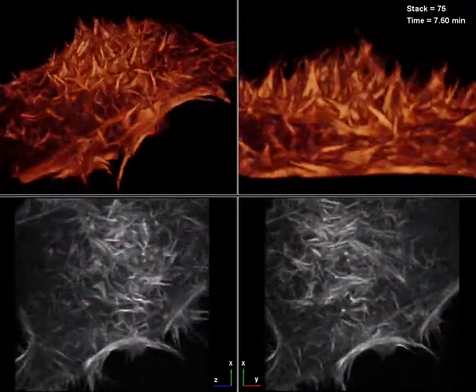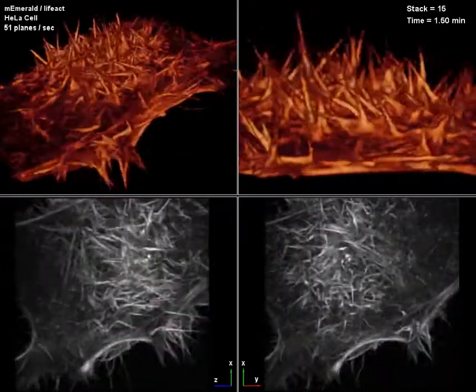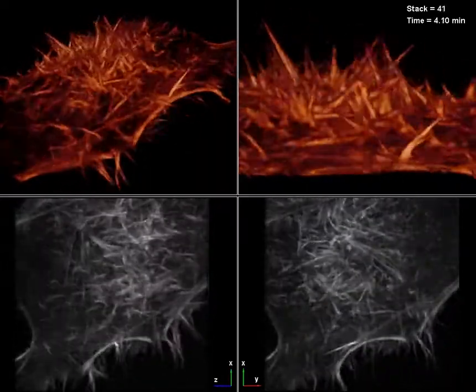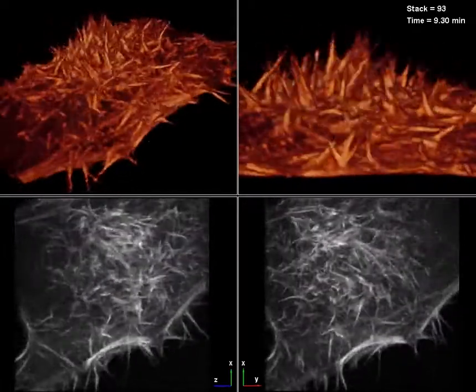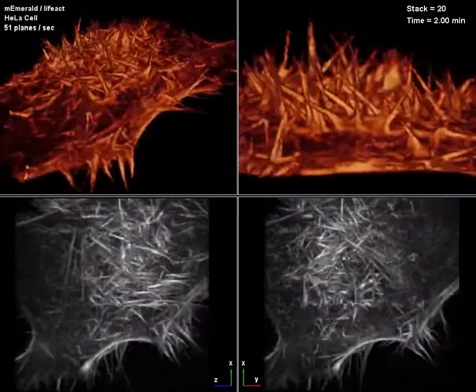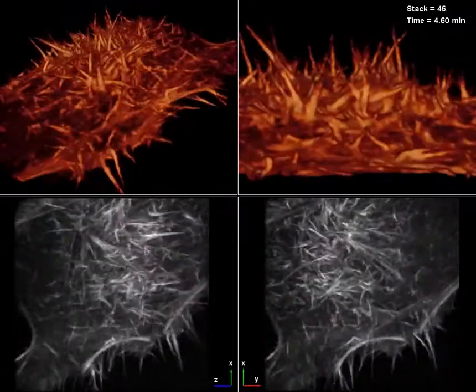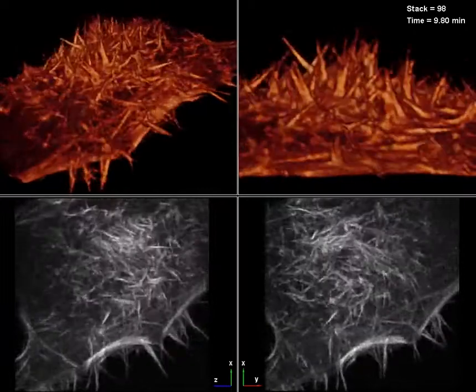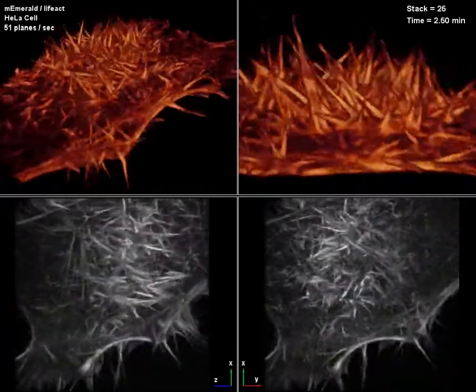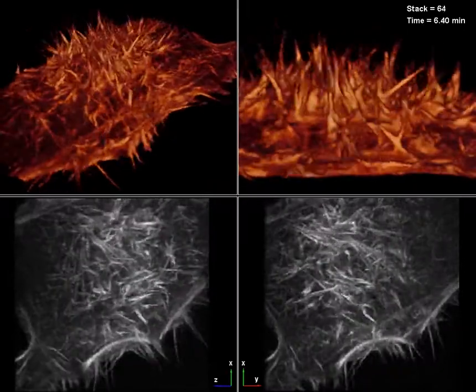HeLa cells are very hardy motile cells, and so they exhibit a lot of these philipodia which allow them to move very effectively throughout matrices and hence, of course, metastasize if they were in a human body and colonize other parts of the body.